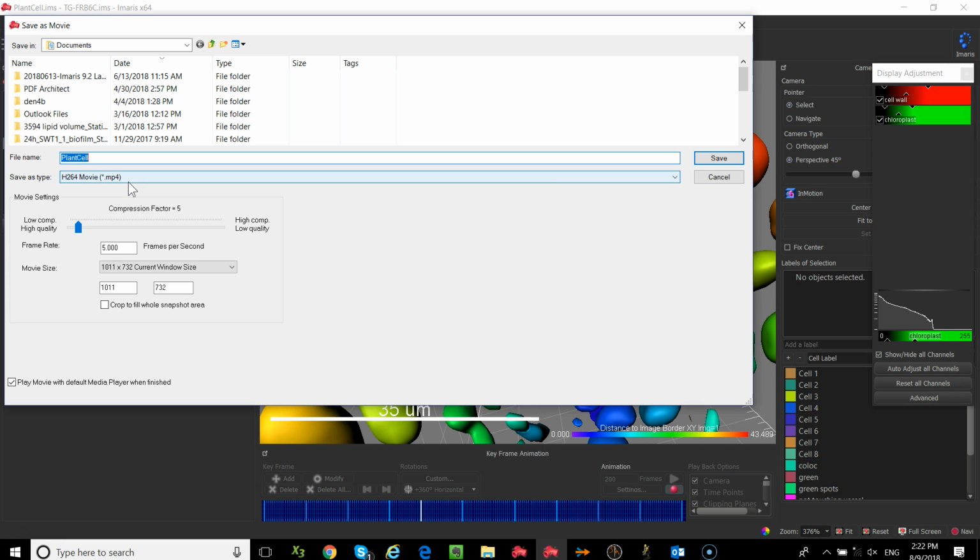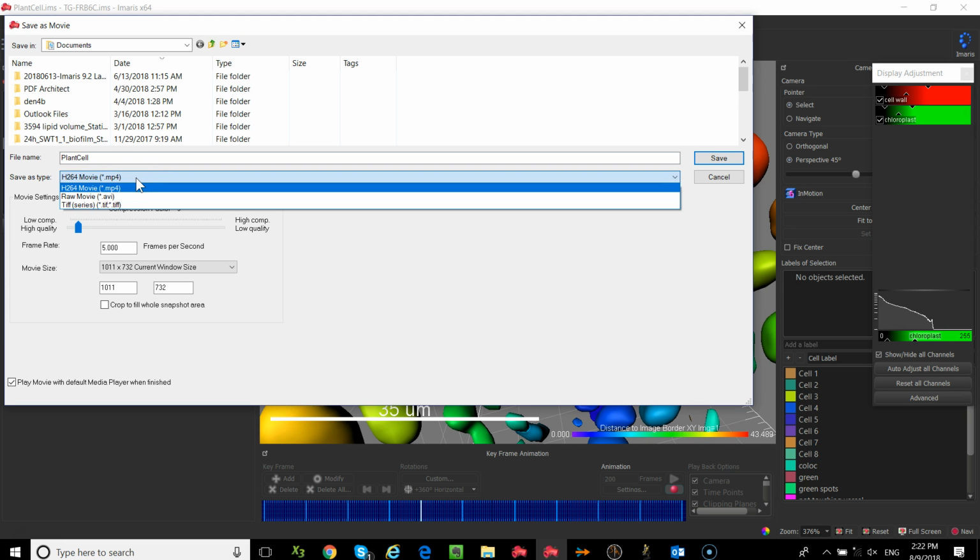So if you're using like Office 97, maybe not. But if it's a current operating system and a current version of PowerPoint or whatever you use, this should work fine. Okay. Just so you know, though, we also provide a raw movie, an AVI that is uncompressed. That's massive. So if you're using that format, be prepared for it to be big.